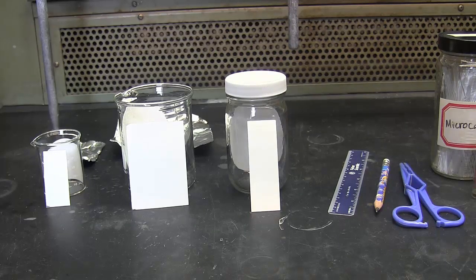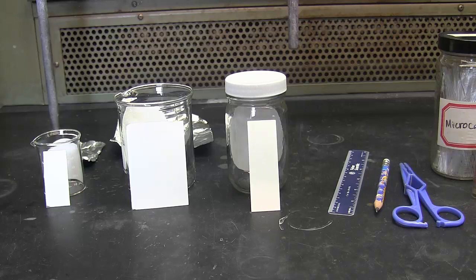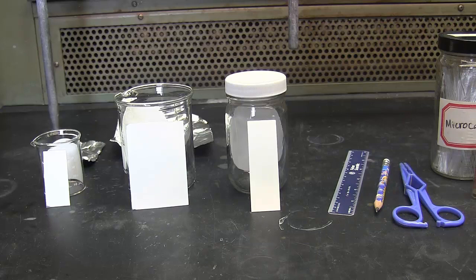In the middle, I have a very large TLC plate. It is so large that the plate does not fit into a jar, so it would be appropriate to use a 250 milliliter beaker for this size TLC plate. We use these plates when analyzing analgesics in over-the-counter pain medications.